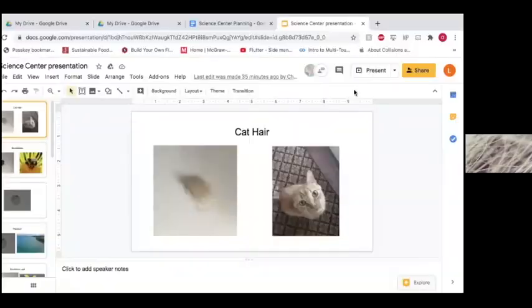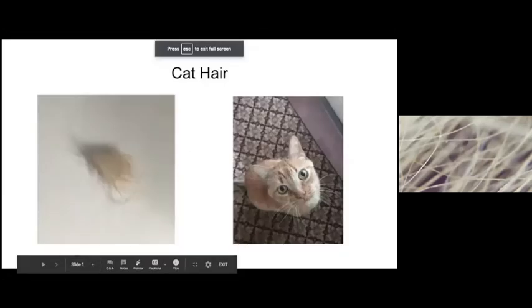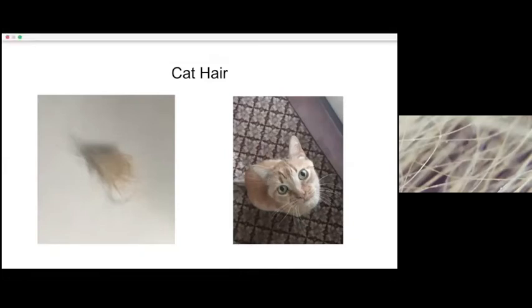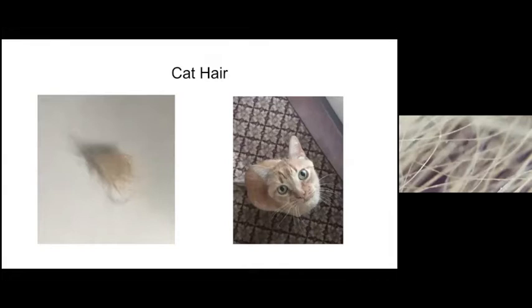So this is actually cat hair under the scope, and if Lydia wants to pull up the macro image of the cat along with the cat hair. So this is actually cat hair from my cat. His name is Rankin. But yes, I brushed him earlier today and got some hair, and it looks pretty cool under the microscope, I think.